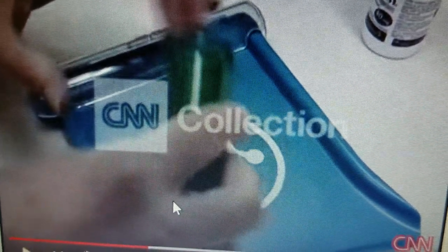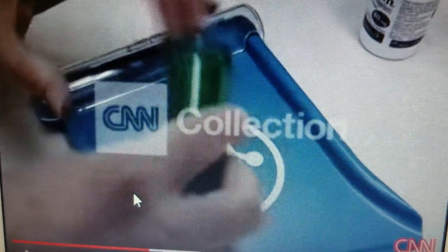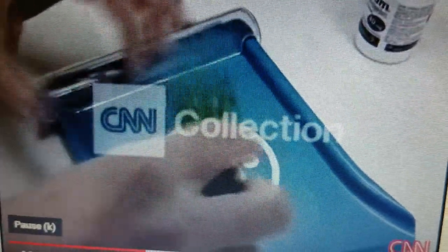This is an example of how to do it. If you drop a pill or something, it shouldn't be touched with your hands, so you should be wearing gloves, and the tray should be cleaned in between counting meds.